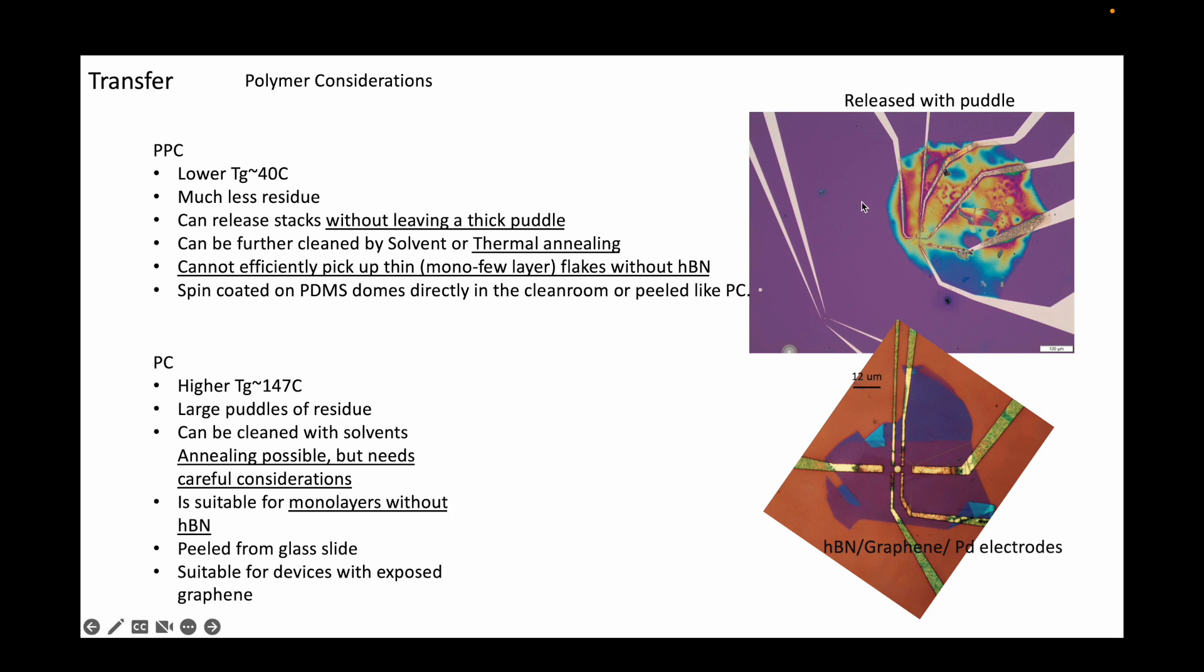What you see here on the top right is a puddle of PC after an attempt to clean it away using a thermal annealer. Before the annealing process, the amount of residue was even worse.